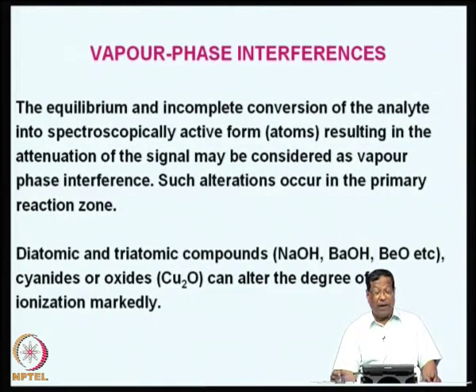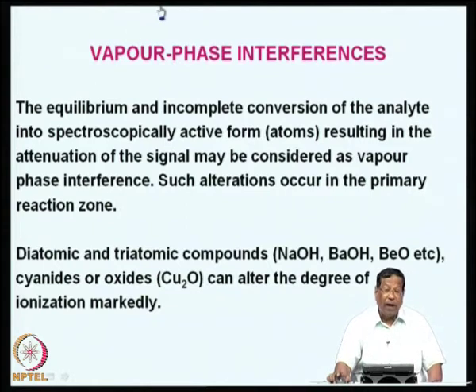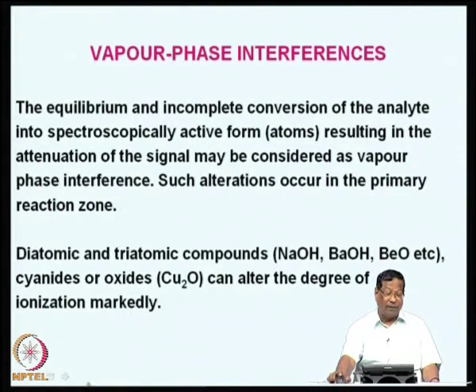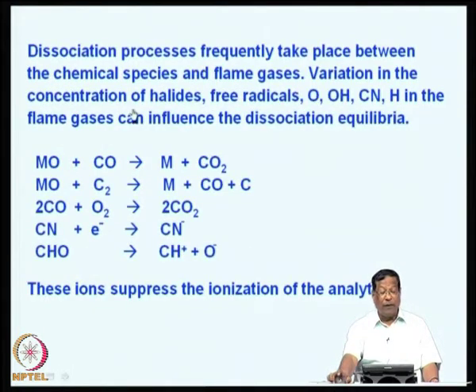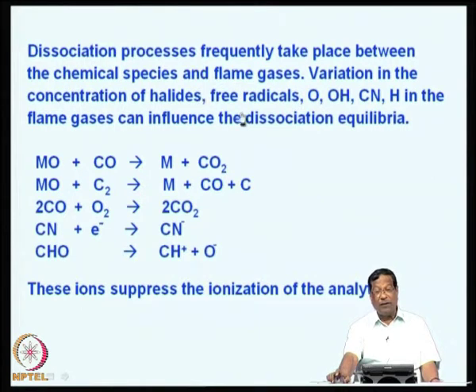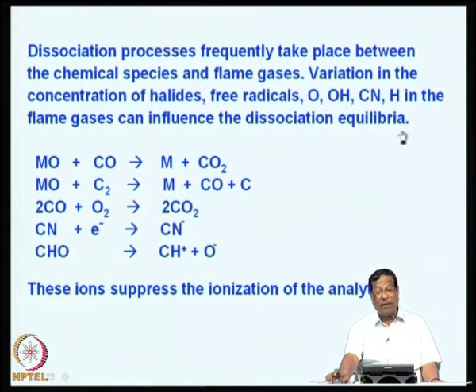Diatomic and triatomic compounds such as sodium hydroxide, barium oxide, cyanides, and oxides are readily formed in the flame and can alter the degree of ionization markedly. This is another type of vapor phase interference; dissociation processes take place between the chemical species and the flame gases.